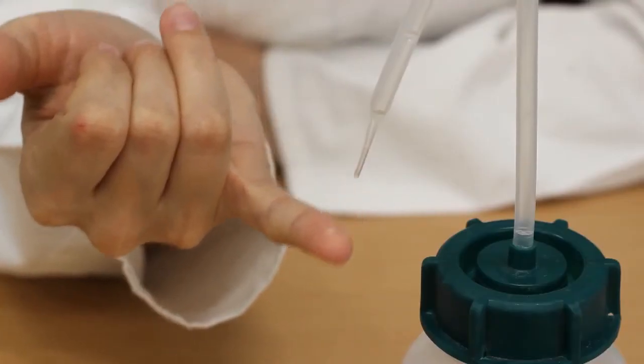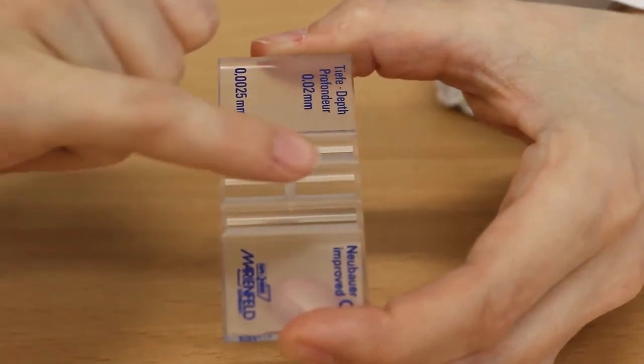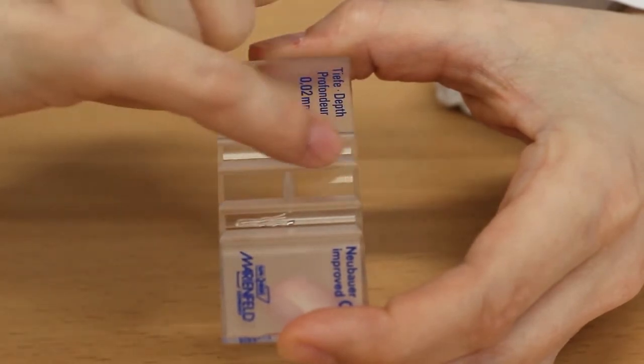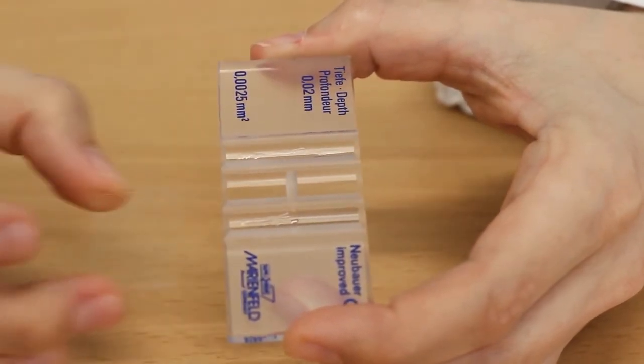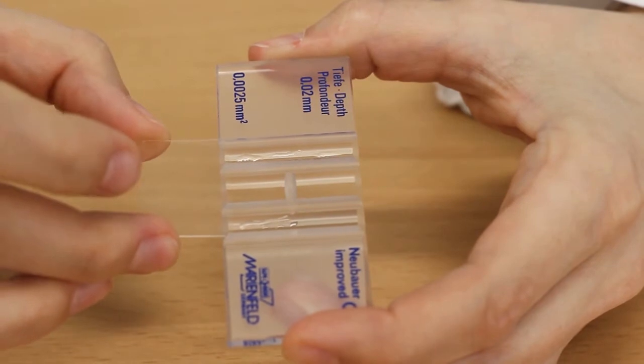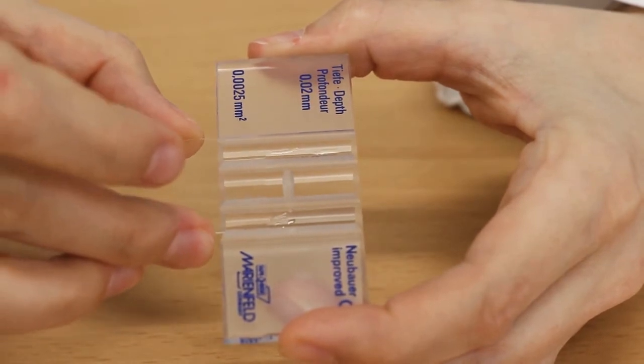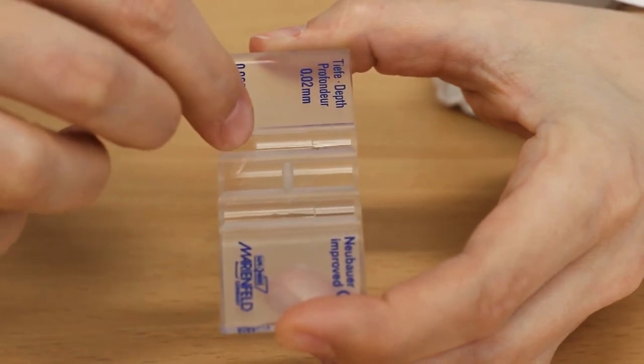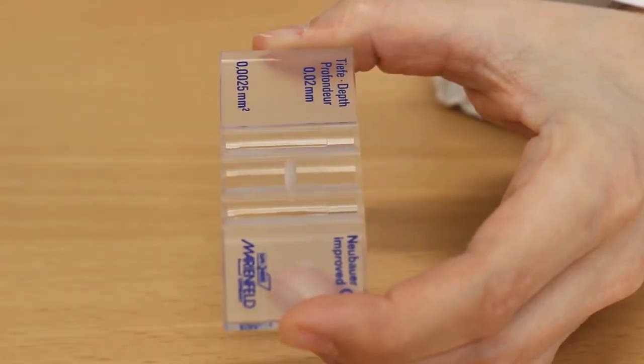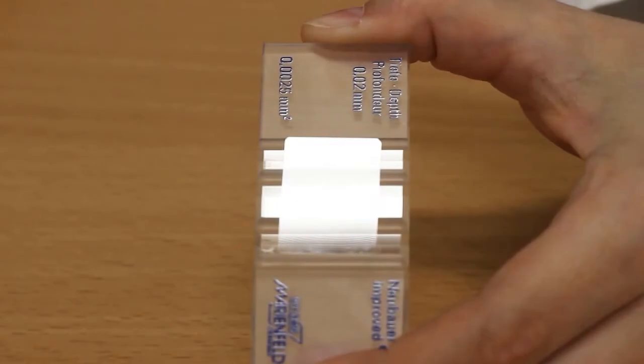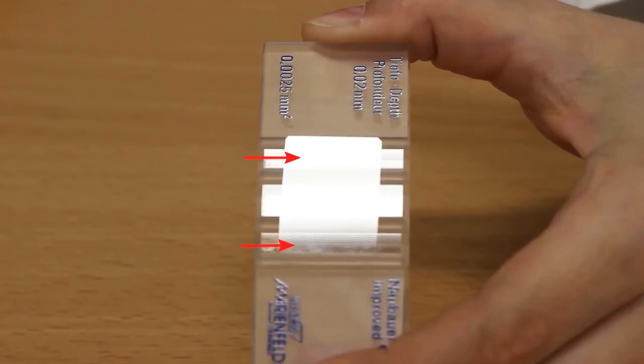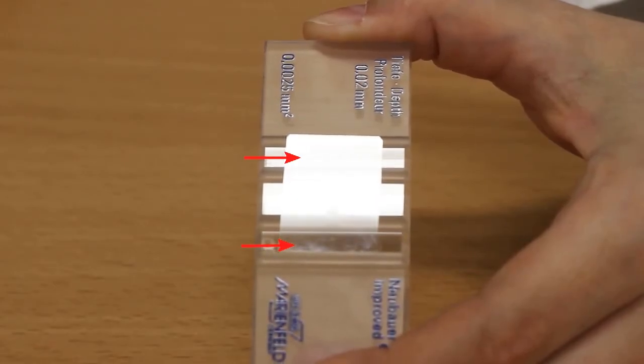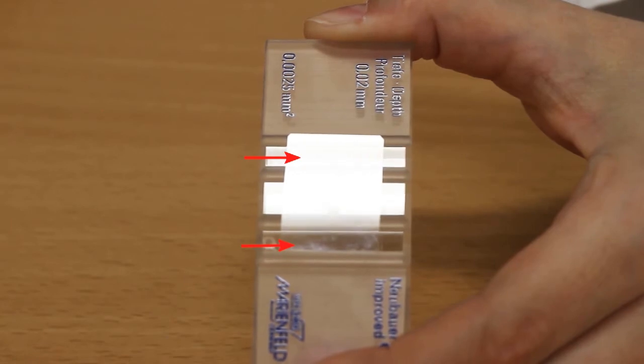To use a hemocytometer, moisten the two support structures with ethanol. Push the coverslip over the two support structures and wait until the ethanol evaporates. Make sure you're using a proper hemocytometer coverslip. Regular microscopy coverslips are not suited and they will bend and distort the volume being analyzed. If the coverslip is placed correctly, ring-shaped interference patterns called Newton rings can be observed.